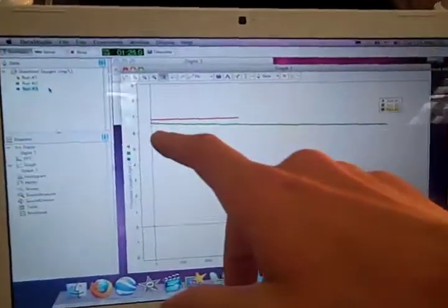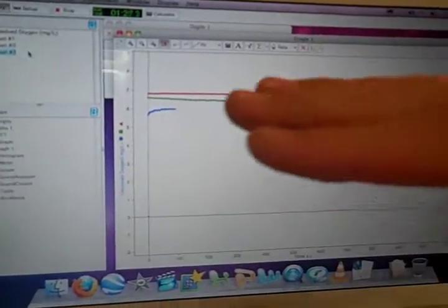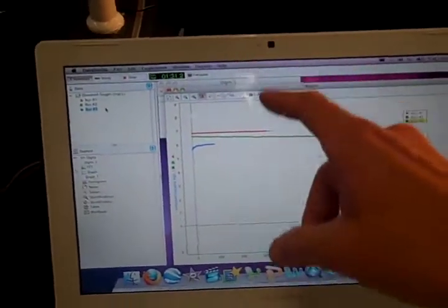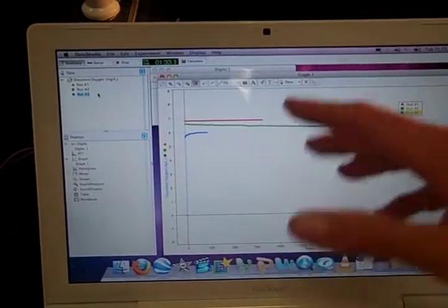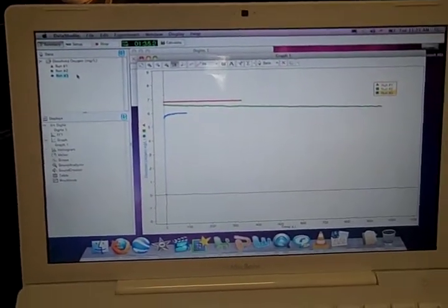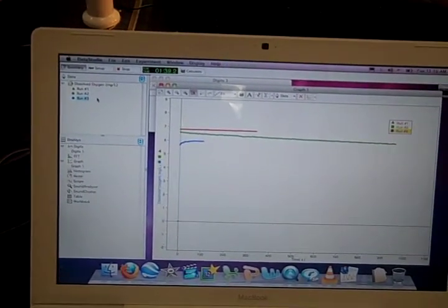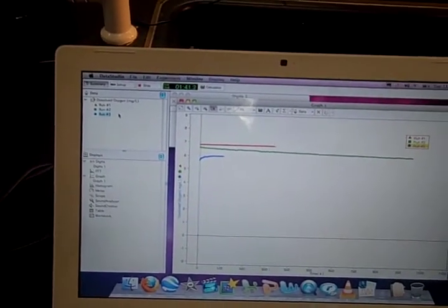Based on our observations, we have found that our hypothesis is completely wrong. It is actually the exact opposite of what we intended. Now, we saw that right when we put in the plant, the oxygen levels immediately started to be below when the water was by itself. And at 50 seconds, which is right about there, we put the light on the plant, and the oxygen levels even started to decrease even more, which was completely what we did not expect.